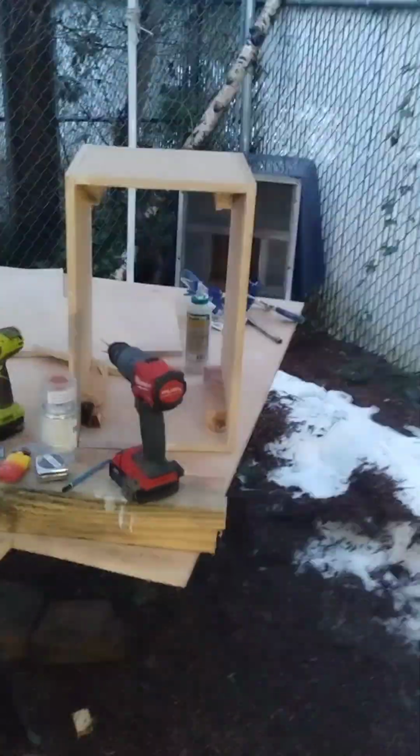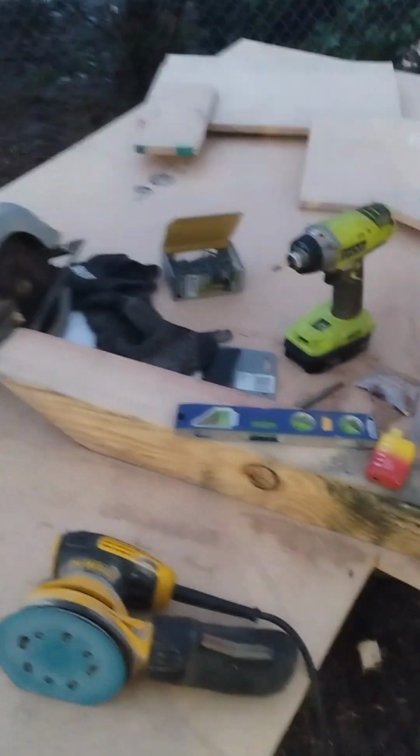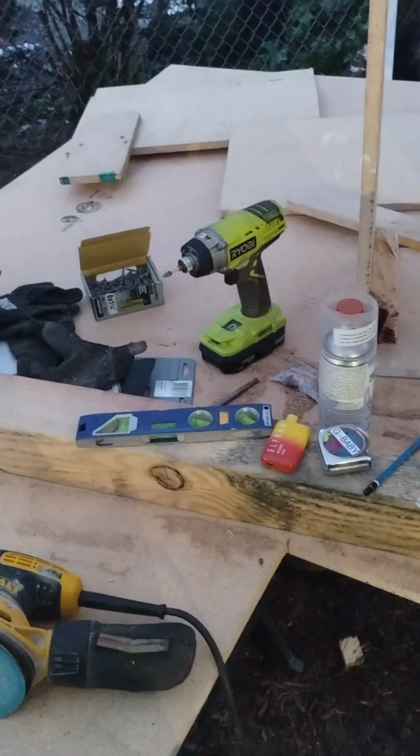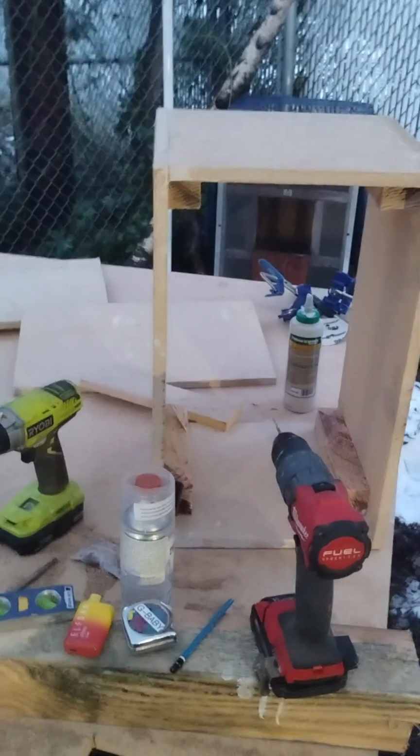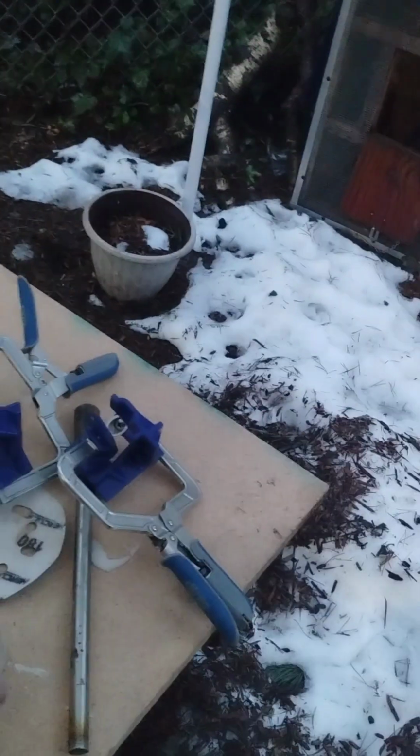Alright, so this is the Broke Boy laminar flow hood tech for under $100. See, I got this piece of particle board for 21 bucks, and then the fan was 80 bucks on Amazon. It's like 270-something CFM, which is good enough, closest to what you need.